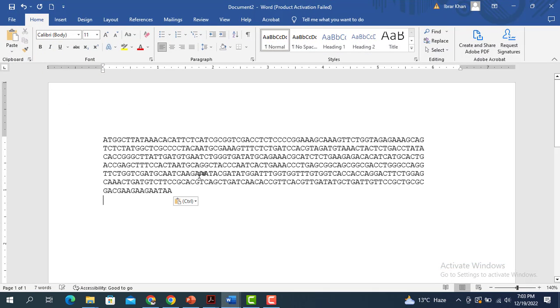One thing to keep in mind: what is a FASTA sequence? The FASTA sequence is actually a text-based representation of the nucleotide sequence of a gene or the amino acid sequence for a particular protein.